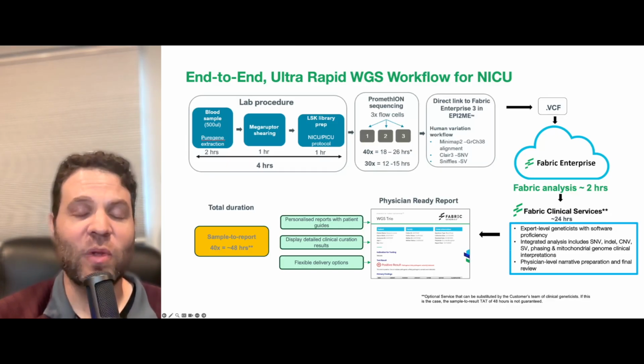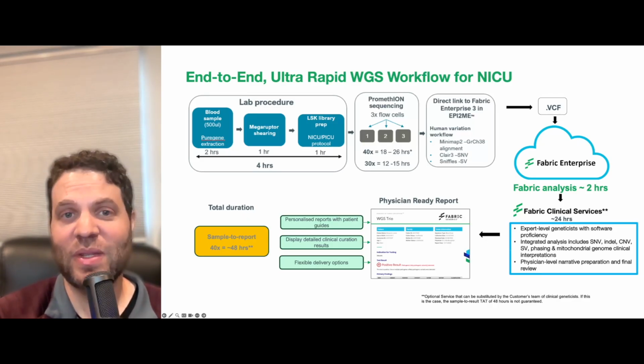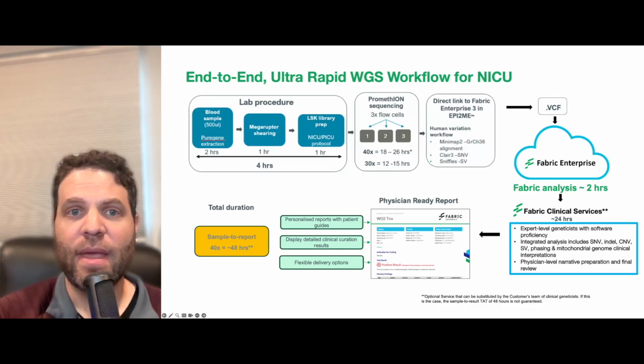Which is pretty incredible. I'm reflecting about how we're about 25 years since the publishing of the human genome sequence. That took a very long time, many years to generate that first sequence. We can now do this in just 2 days, interpreted for that patient.